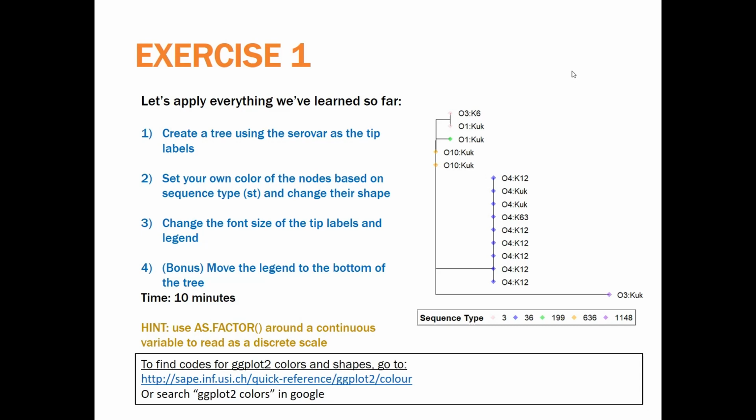I'm sorry, I don't understand this question. I think it's like you want to change the file name, then run the code and make sure the things change, and then change the legend name? Yeah, that's kind of why I do it step by step, because I like to see if you do just change one thing at a time, it's easy to see what it changes.